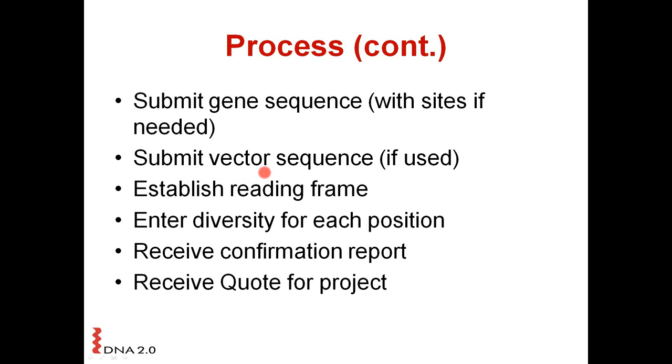Secondly, submit the vector sequence that you or we, depending on the project, are going to clone this into, and that's only if this is something that is going to be used for your specific project. Establish a reading frame so that we can make sure that whatever this submitted gene sequence is going to be in frame with whatever else you have present in the vector.